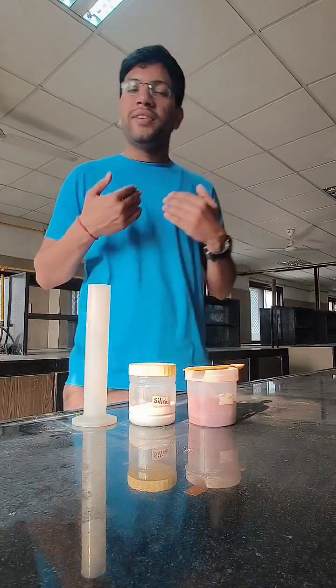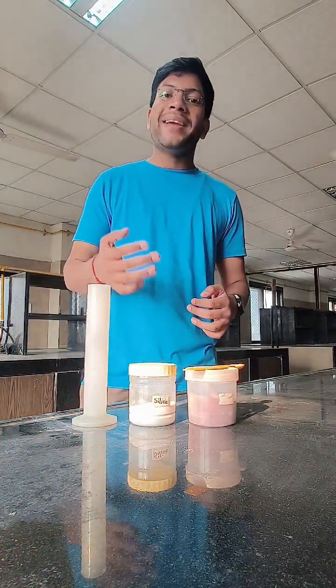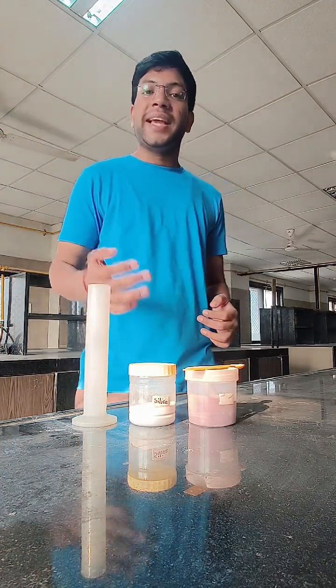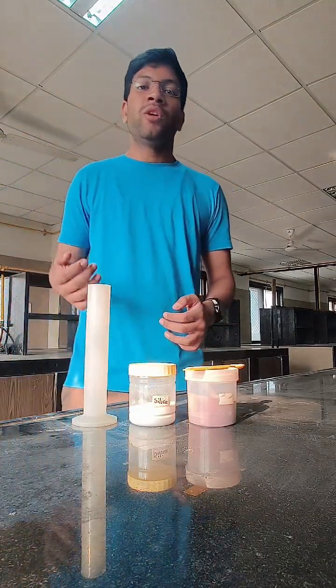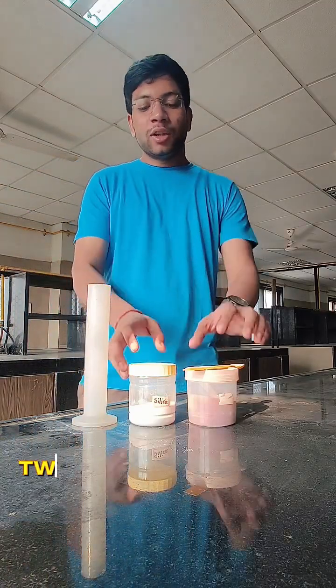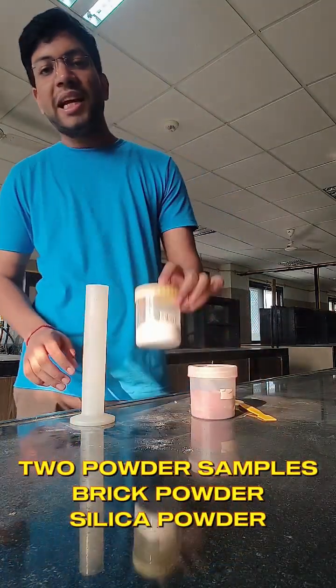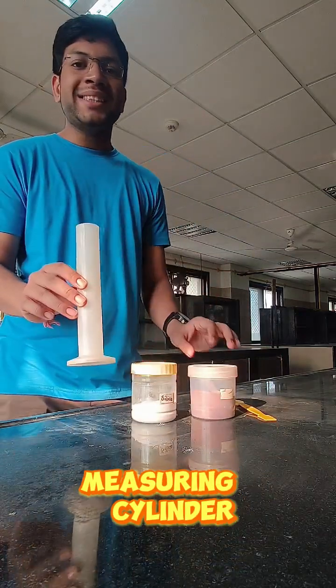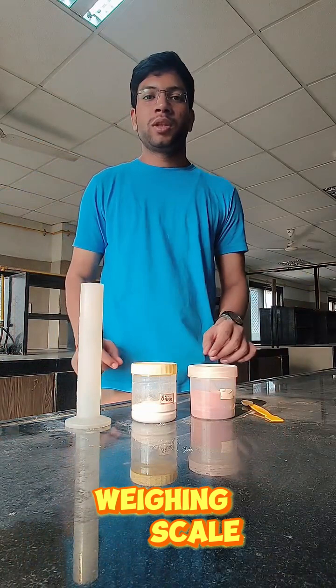Hello everyone. Today we, a group of two, Dushyant and Kanishk, are here to perform a mechanical operation experiment which is aimed to study the various bulk properties of powder sample. For this experiment we need two powder samples, brick powder and silica powder, a measuring cylinder, spatula and a weighing scale.